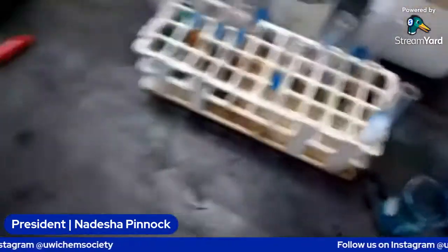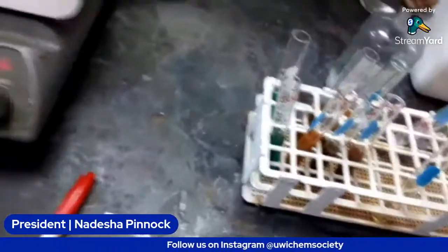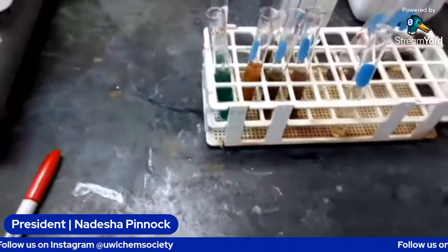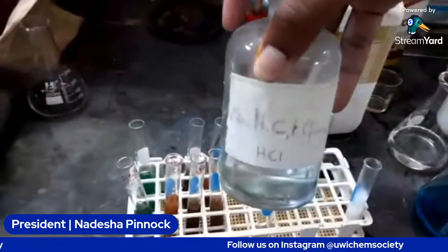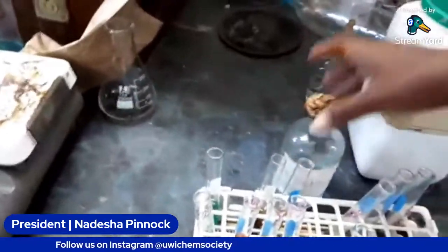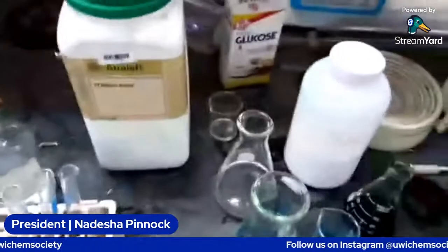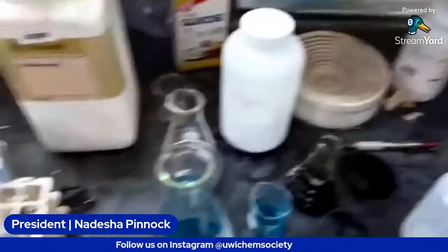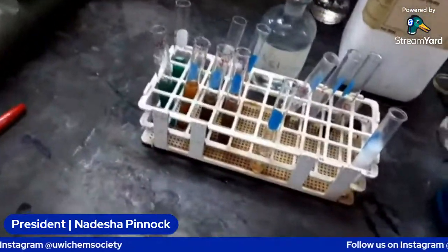So what we're going to do is add the acid so it can hydrolyze any disaccharides that are present, and we're going to see the difference in the results that we get when we add the acid to it. The acid that we're using is HCl. So we're going to add a bit of HCl, mix it, then we neutralize it with some sodium bicarbonate, and then we add the Benedict's reagent.